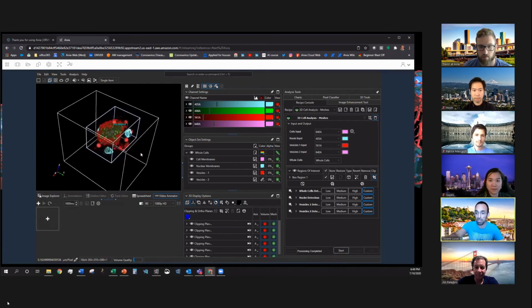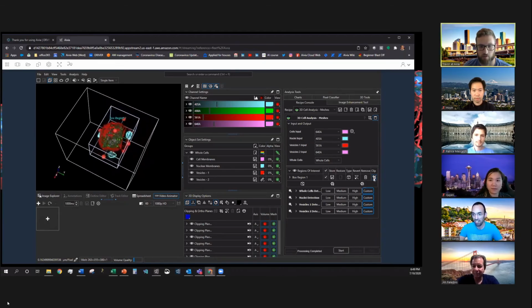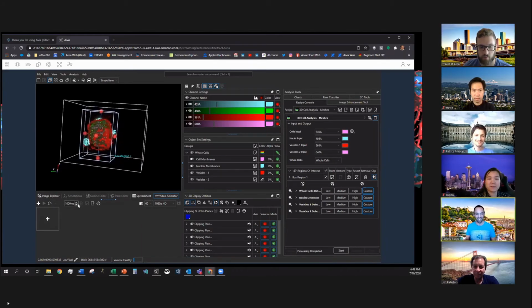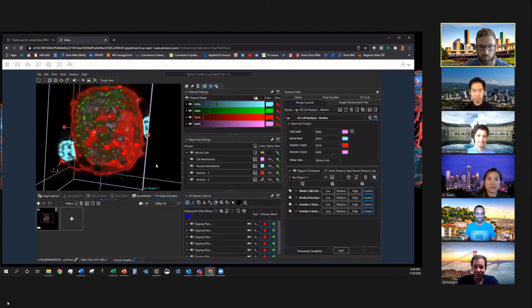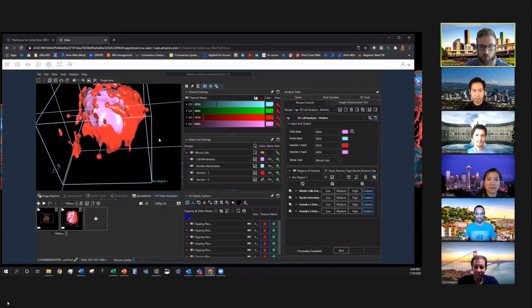I think the clipping plane is still on for the recipe over here. Okay. I'll focus on this object here. Okay. So I'll start with a bird's eye view. Then maybe I think a good thing would be to zoom in and maybe at the same time take away the channels just so we have some context. And then do a slow rotation.